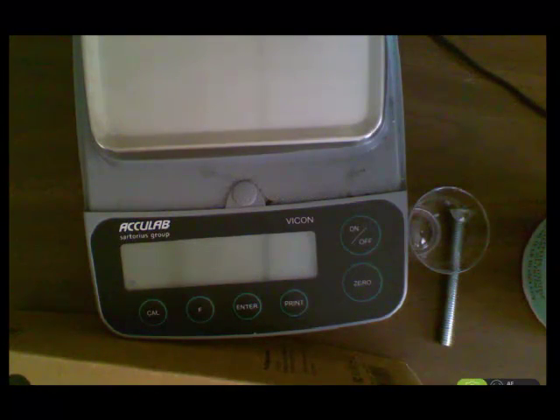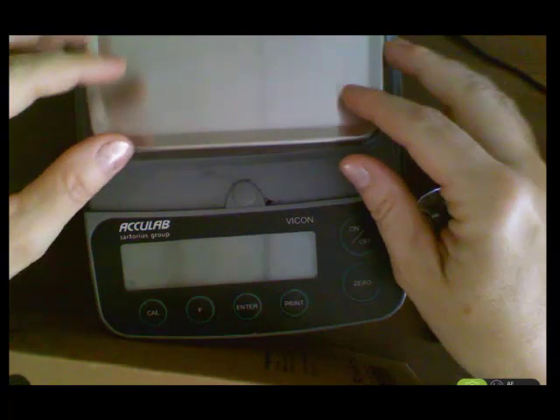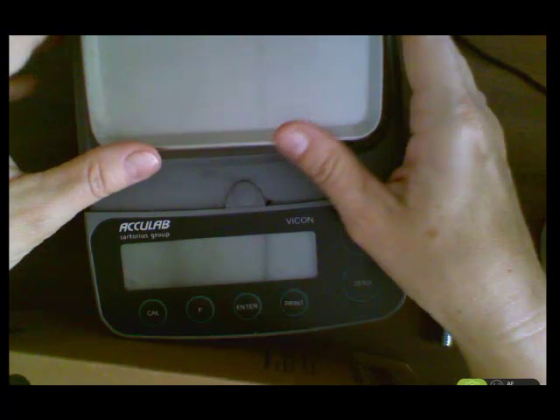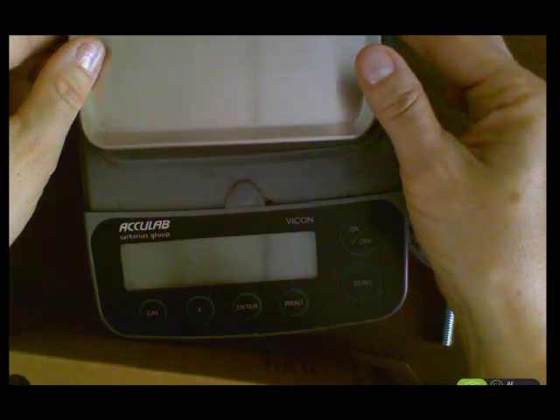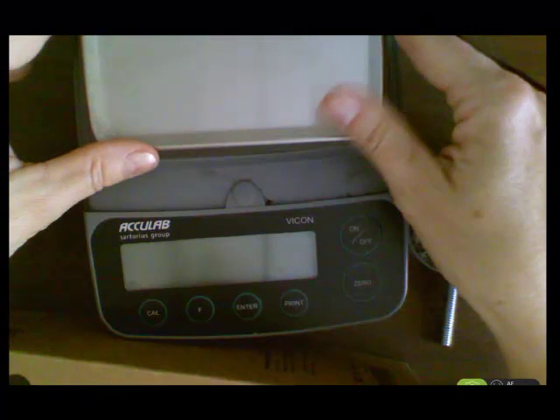Okay, now we're going to talk about measuring mass in the lab, and this is one of the digital balances that we have, and typically this is what they look like. There's a metal pan here, and so the first thing you want to do is clean that pan, make sure that there's nothing on there. The metal pans actually come off, so you can take those off, rub them off with a paper towel, and then you can set those right back on. You don't want to do that while the balance is turned on, however.